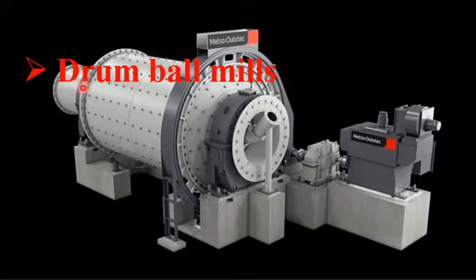Students, please note that in the drum ball mill machine, the sample, which is usually a pre-crushed or bulk material, is placed inside the drum, which has grinding balls, and both the bulk material and the grinding balls inside the drum are subject to external force. When the external force is applied, the drum starts to rotate around the horizontal axis.